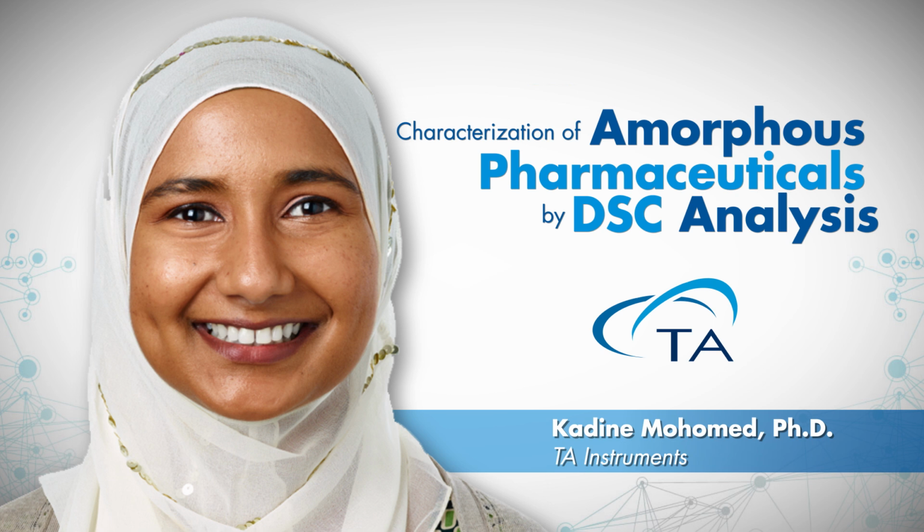Could you discuss the differences in DSC results when using a reusable alumina pan that does not have a hermetic seal, such as pans used in the Q600 SDT, as opposed to a hermetic pan?